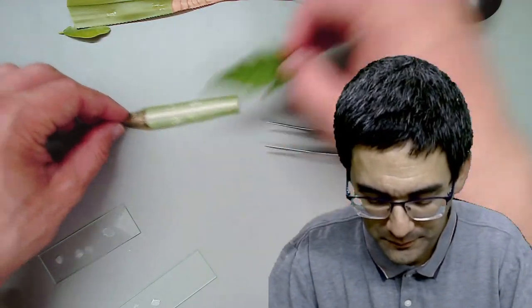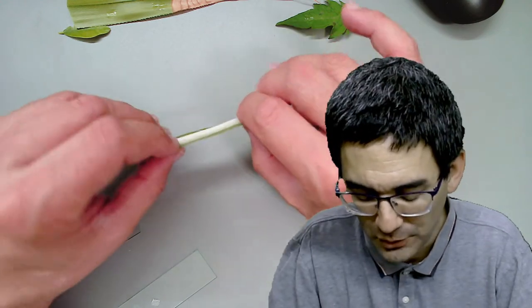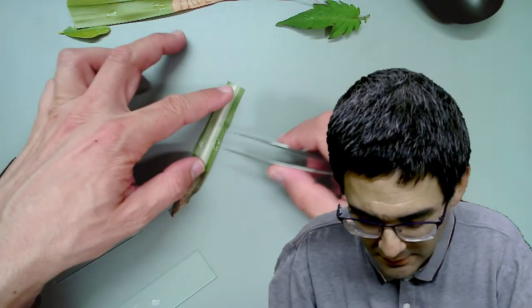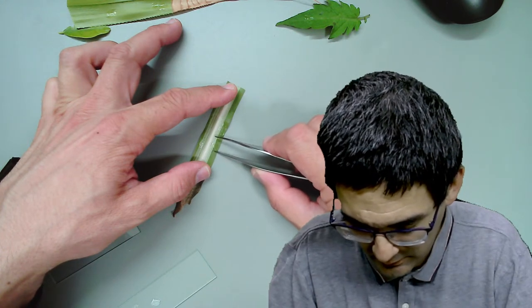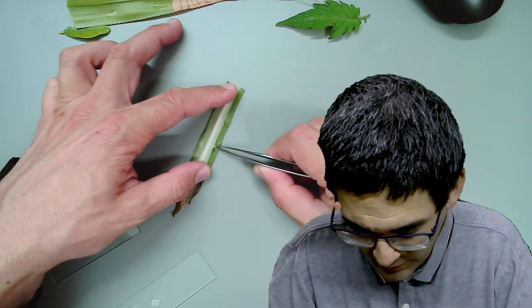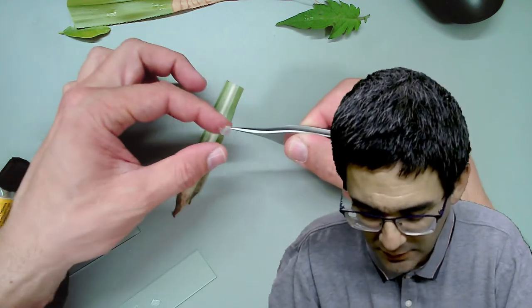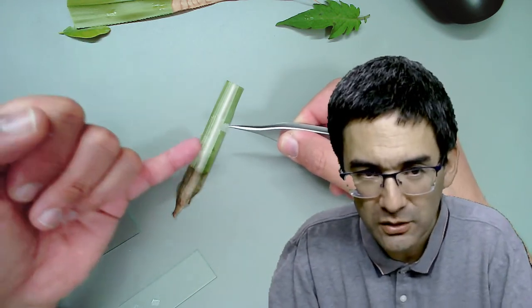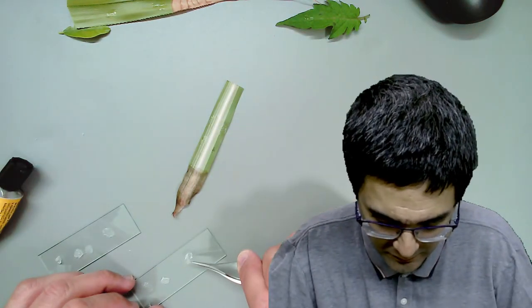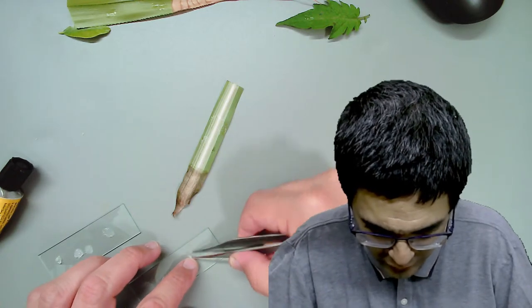I still have one more leaf left. Unless you have any specific questions, let's try this plant here. I've made four spots again - this is the bottom side. Sometimes you end up destroying the leaf in this process. What I found useful is not to make the spots too big, because if you make them too big it's going to be difficult to peel off.